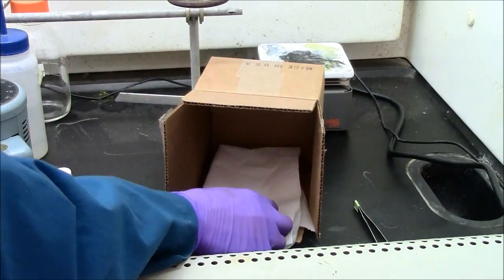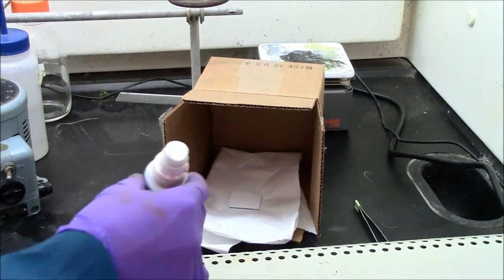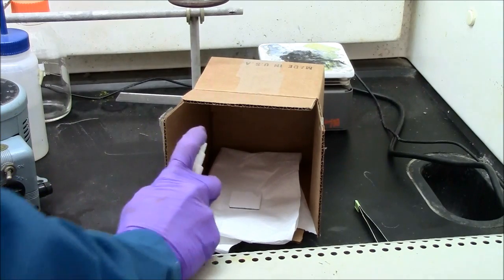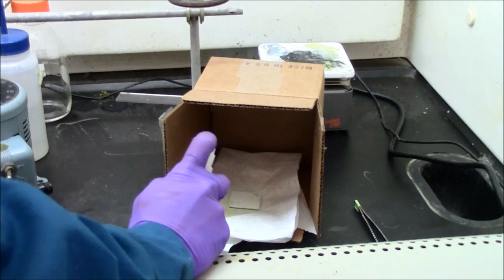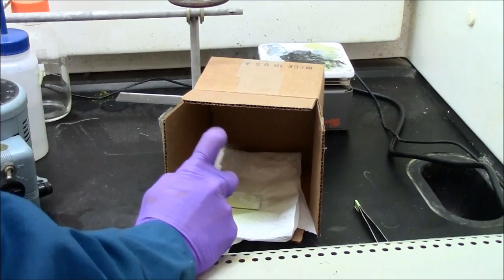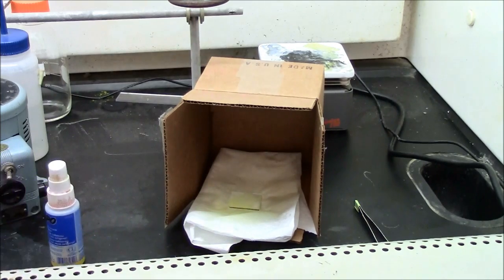Here I have my plate for staining. I'm using the spray bottle. It's in the box. It's got paper towels 3 or 4 layers thick on the bottom. I spray until the plate is saturated, and then I heat on the hot plate.